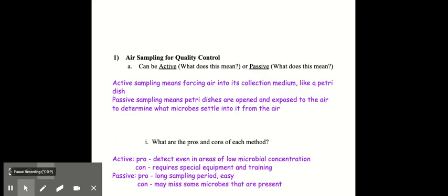In this lab I'm going to show you air sampling for quality control. So there's two ways of doing air sampling. It can be active or passive. So what does that mean?